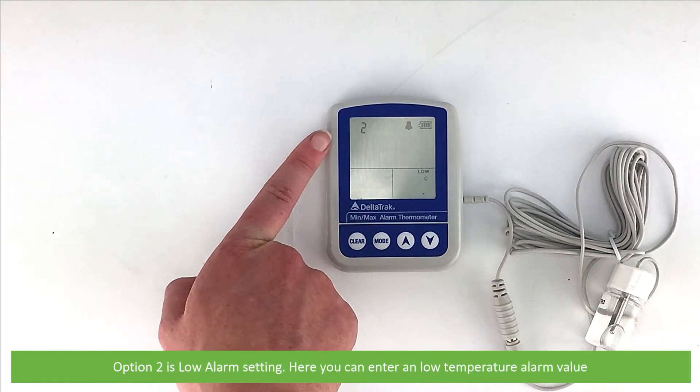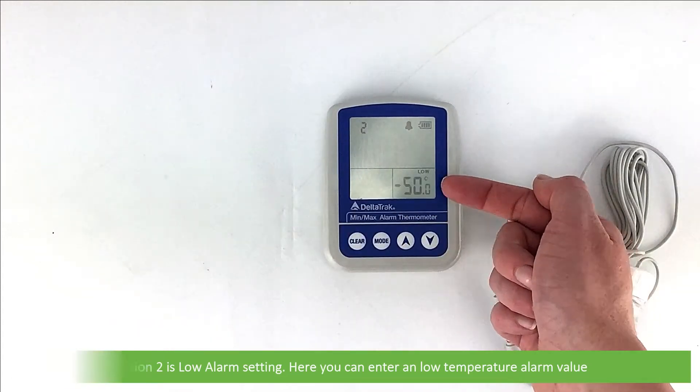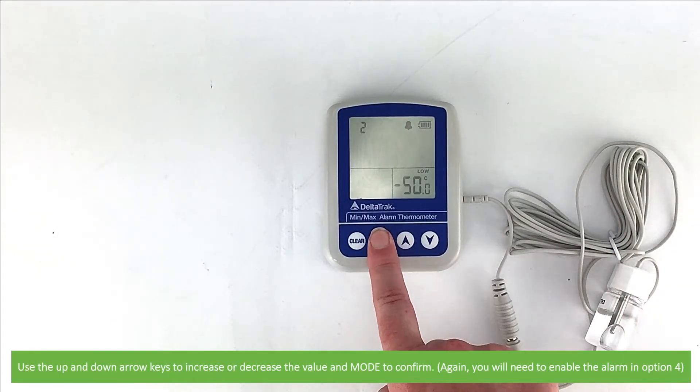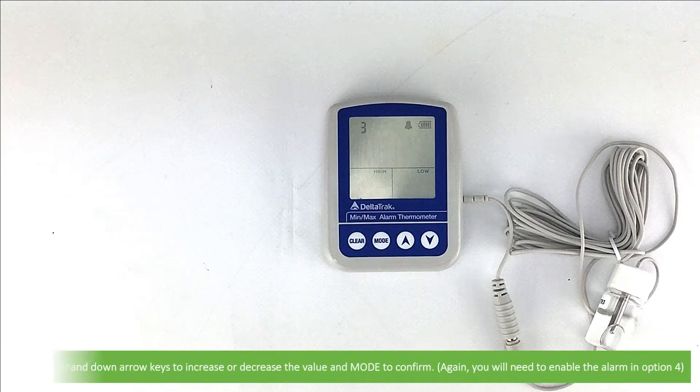Option 2 is the low alarm setting. Here you can enter a low temperature alarm value. Use the up and down arrow keys to increase or decrease the value and Mode to confirm. Again, you will need to enable the alarm in Option 4.